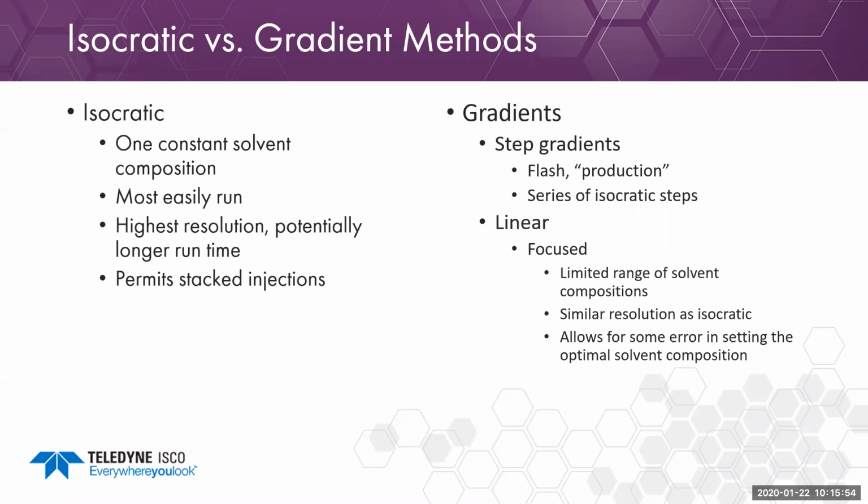As you get compounds that start to co-elute, we need to work towards an isocratic method to get separation to maximize that. One of the advantages of isocratic separations is that it does permit stacked injections, as you can purify multiple injections of the same compound over and over because your solvent composition is not varying. More commonly, though, in Prep HPLC with purifications, especially small molecules, or when you're purifying from multiple impurities, a gradient method is used.